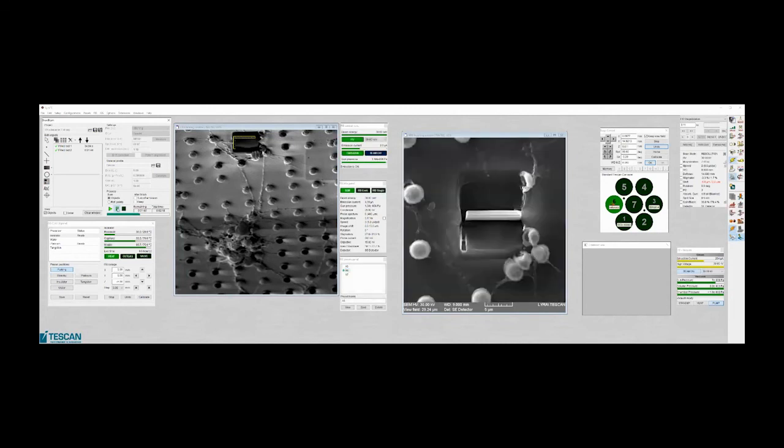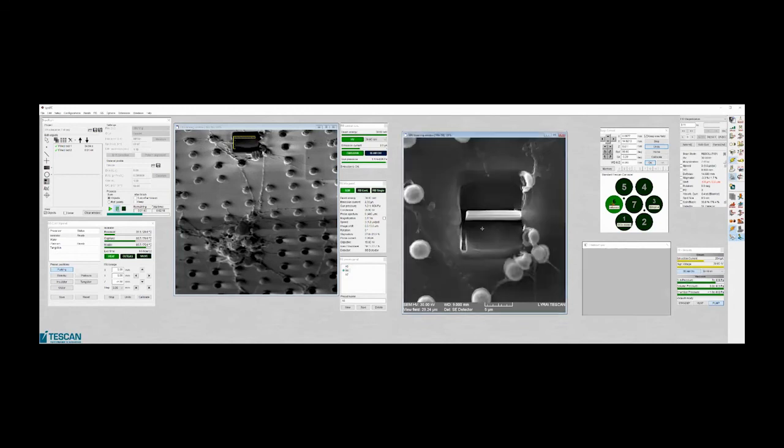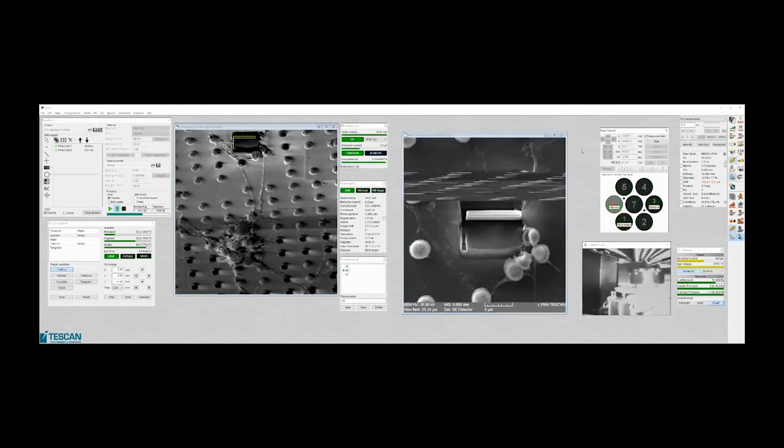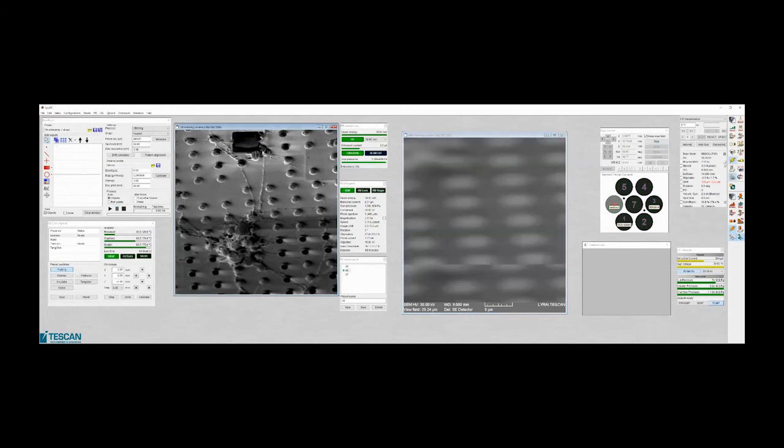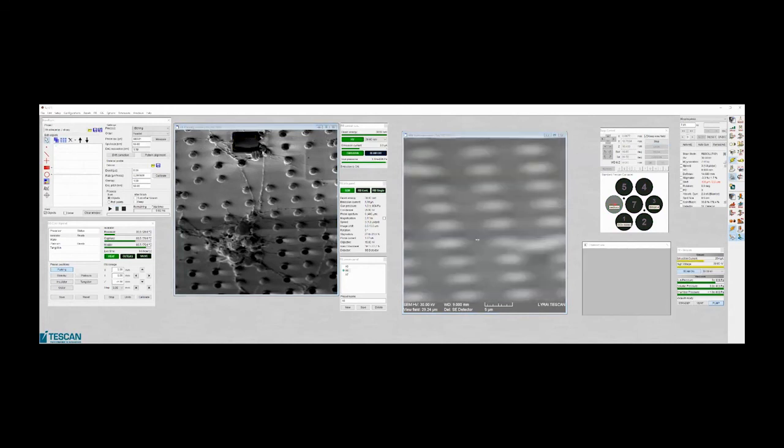Okay, it's taking more time than I thought. Let's say 5 more seconds, and I will check if it's cut or not. Doesn't seem so. Seems that it's too thick. So we will check. If not, I will let it be and I will show you something more interesting, because it should be boring for you, isn't it?